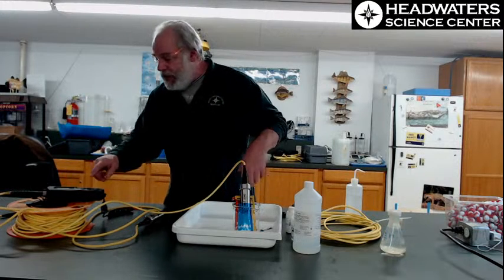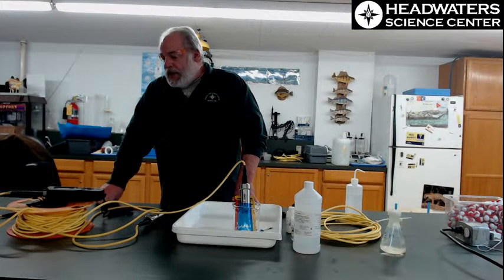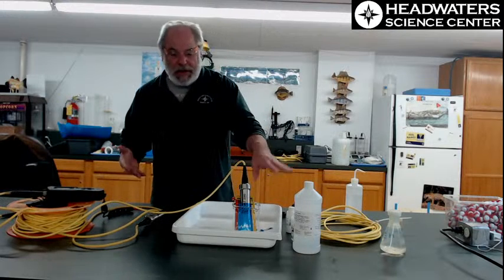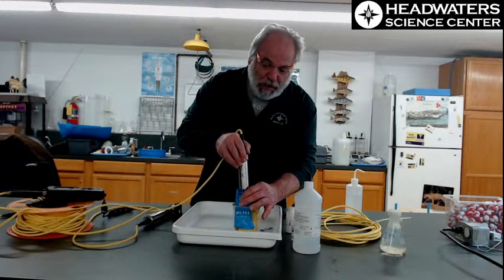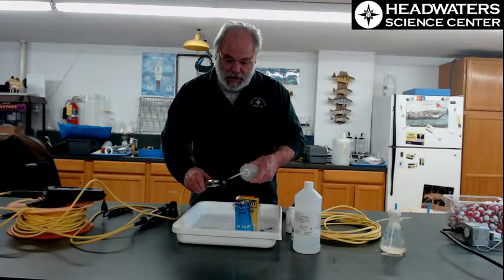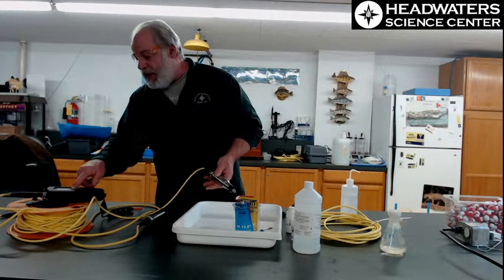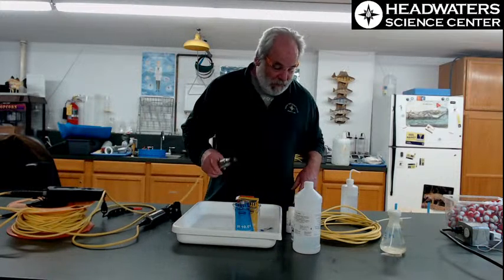So we came back at 10.05. We'll calibrate that. I think it'll actually calibrate a little higher than that. We'll see, because we're here at this cooler temperature, and it is calibrating a little higher at 10.08. So that's what this temperature and this amount of electricity has decided should be the proper pH of that solution. Now the meter stores all this stuff, so if I need to show the record of my pH, I can do that later.